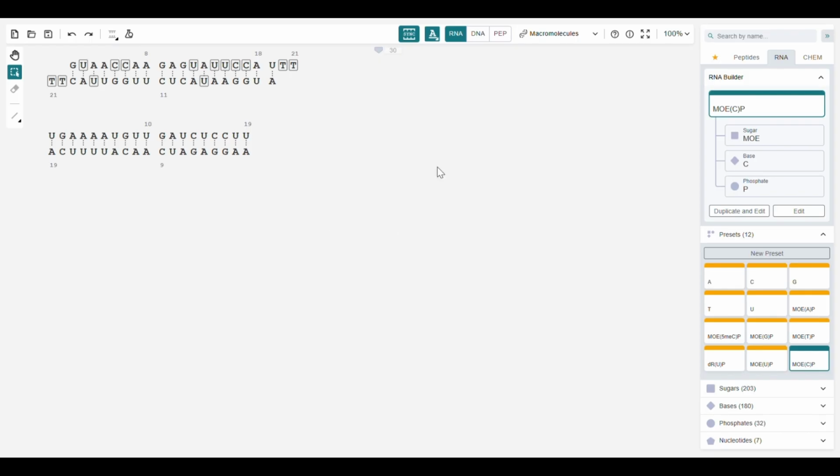First, I'll add the same overhangs as in the previous example. There is a single nucleotide bulge loop at the 4th position of the sense strand. Still in non-sync mode, I'll type U. On the opposite chain, I see a line. That line indicates a backbone on the opposite chain. The antisense chain is still the same, but a complementary nucleotide for the one added doesn't exist.